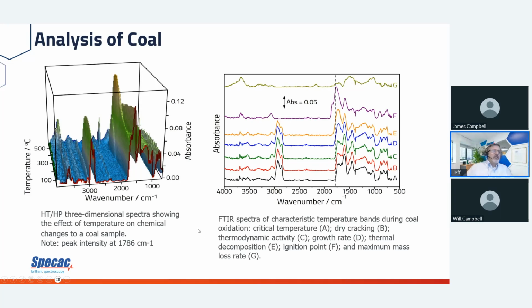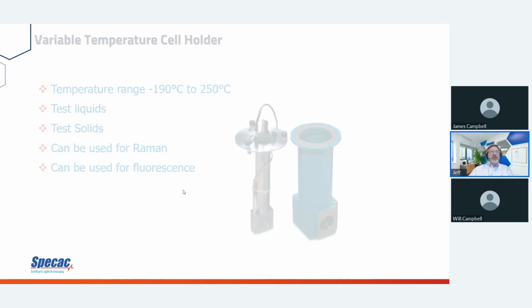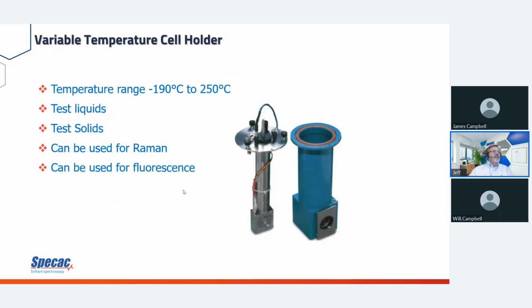There's a lot you can do with this. There is a tremendous amount of data there that you can collect with this accessory, with the high pressure, high temperature cell. It works quite well. I wish I was able to get more data on it. It's really neat to work on. It's really cool.